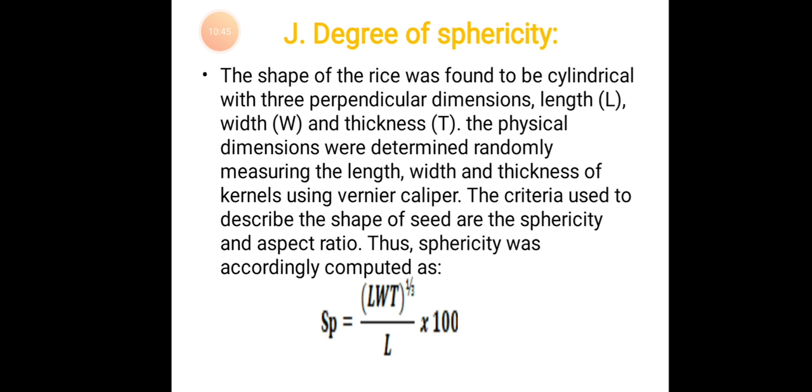So these are the different quality parameters that need to be checked for the commodities, cereals. Thank you for your patience in listening. By this we can determine the quality of the taken commodity.